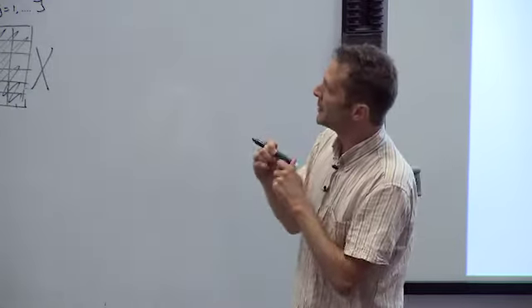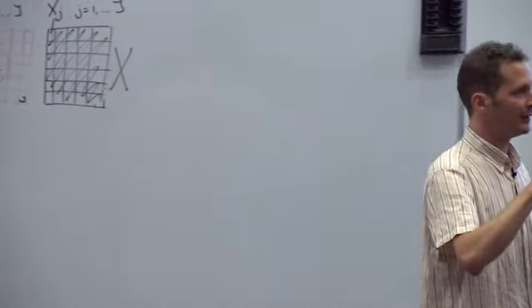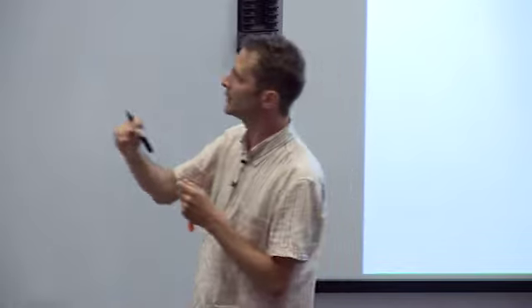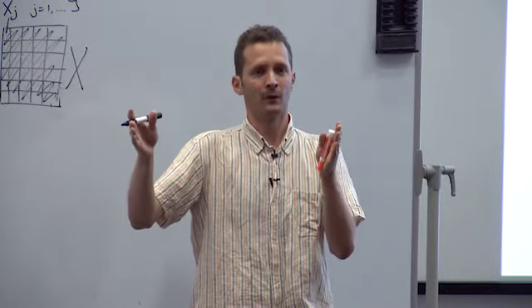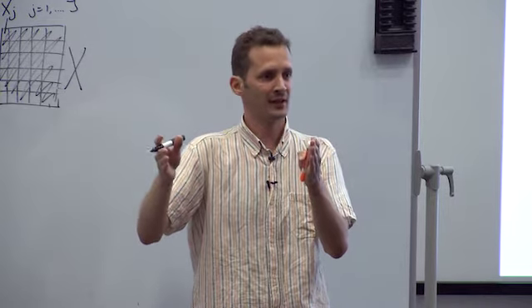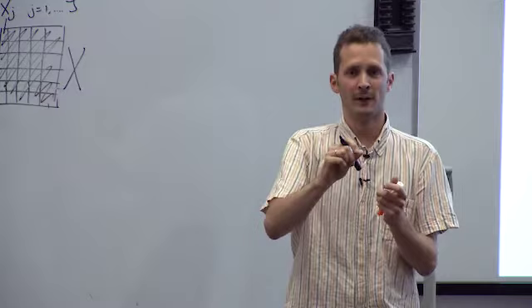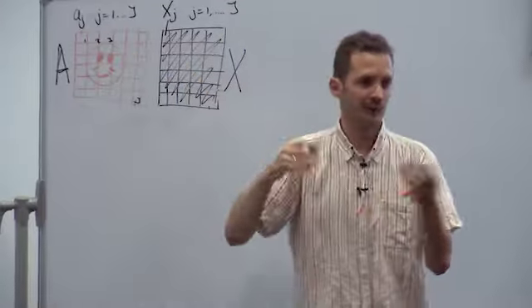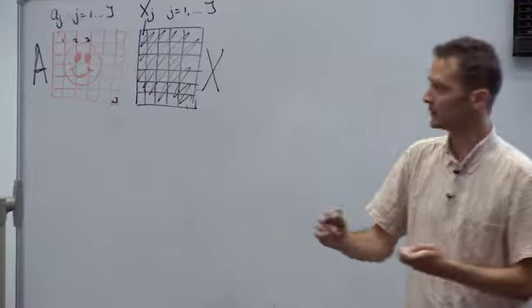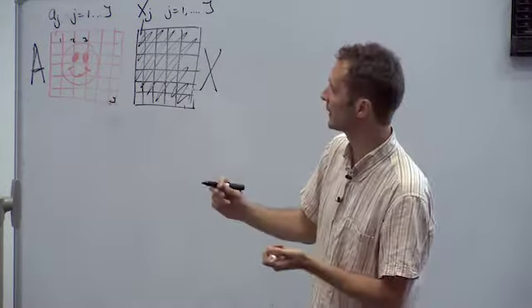As Paula already explained, an image is just a two-dimensional array of intensity values. If it's a grayscale image, every pixel has one value, and you build up the image by having all those pixels next to each other. So white could be high values and black could be low values, typically.